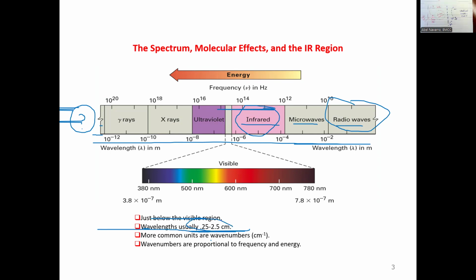And we use it as wave numbers. Remember that in general chemistry for UV-Vis, you will say, oh, I'm doing a reading at 500 nanometers. That would be the convention. So, my sample, I need to read at 500 nanometers. Or if you're doing biology, like a cell culture, you want to see how fast you grow your bacteria, you also have another one. I remember it's 560 or something. I don't remember exactly, but you always read at a particular nanometer, which is the wavelength.